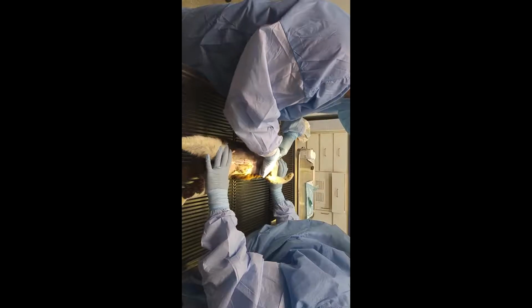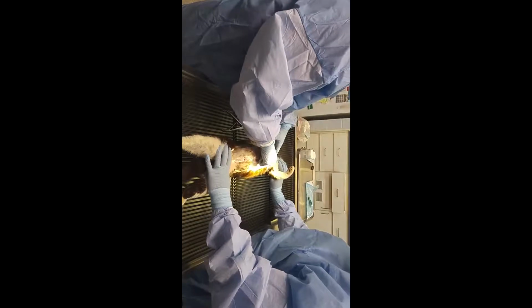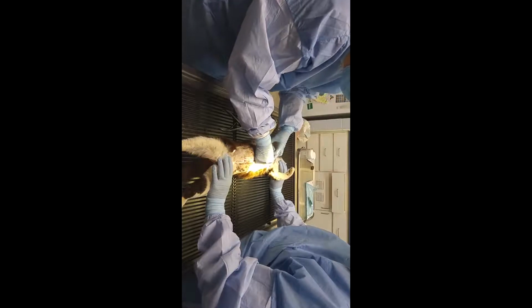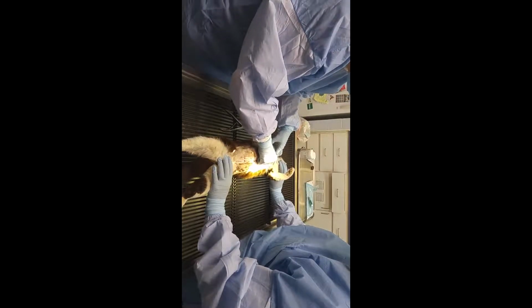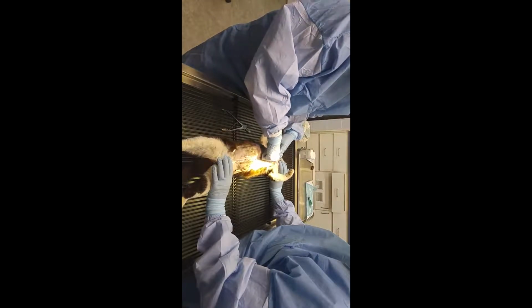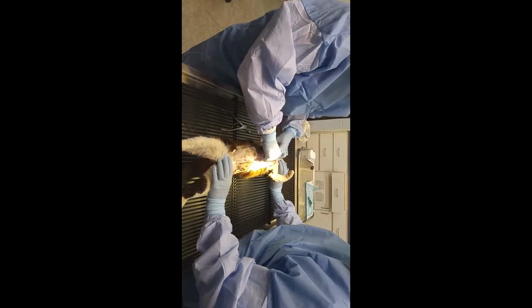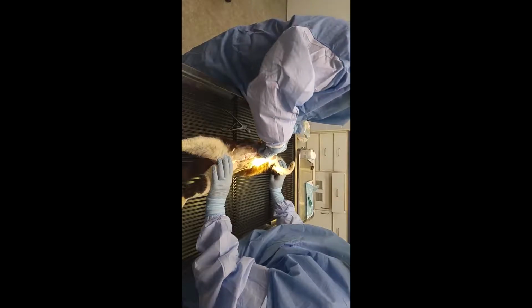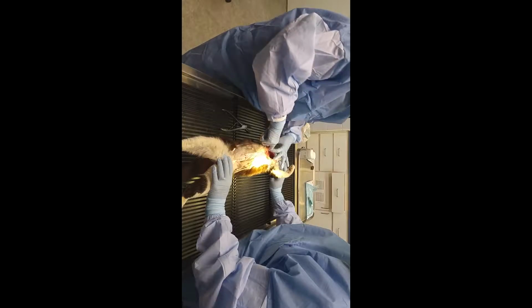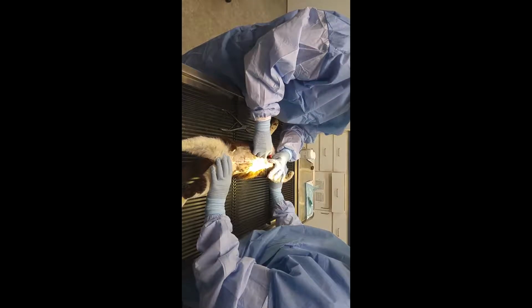Ordinarily, if we were suspicious of anything with this cat as far as the heart is concerned, we would incise the inside, looking for evidence of heartworms, or more importantly, really to look for evidence of left ventricular hypertrophy in the case of hypertrophic cardiomyopathy, which is common in cats. And truthfully, with heartworm disease in cats, we probably would be paying more attention to the lungs to see if there were any changes there. We can actually see the diaphragm, this thin sheet here, and that all looks good.